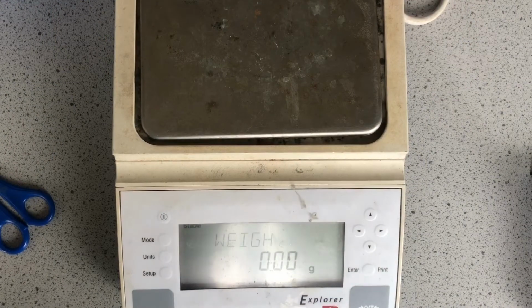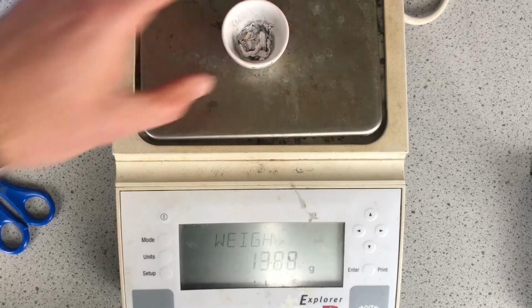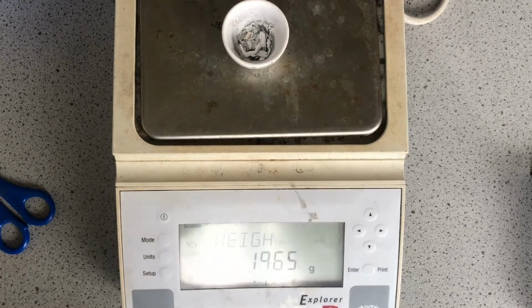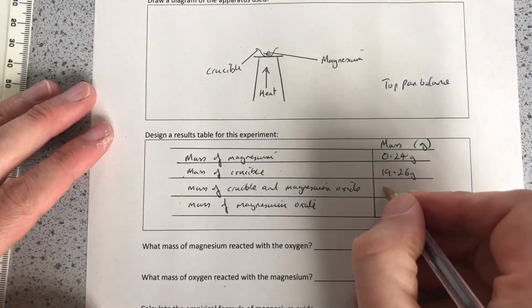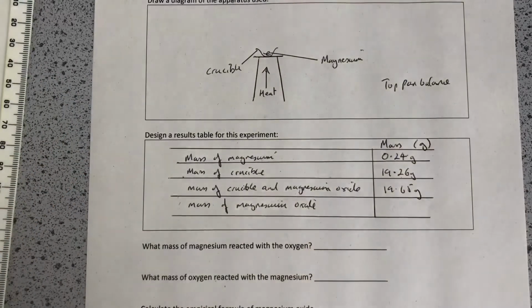So we're now ready to reweigh the crucible and the magnesium oxide. It's cooled nicely, so we'll put it on the balance, and we've got 19.65 grams. So let's fill that in here now. We've got 19.65 grams for the crucible and the magnesium oxide.